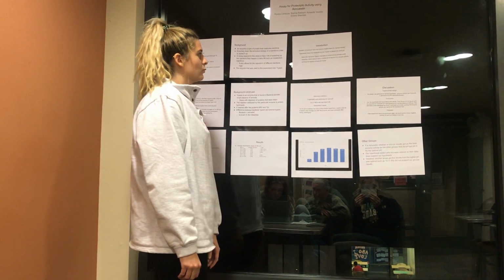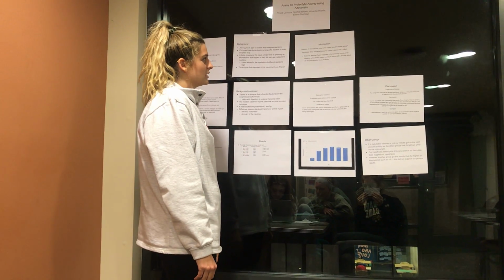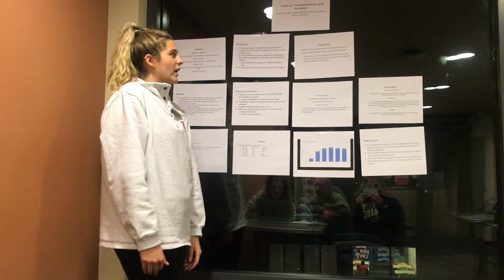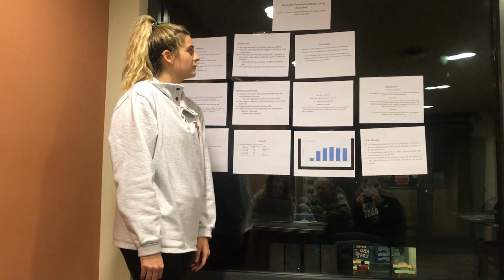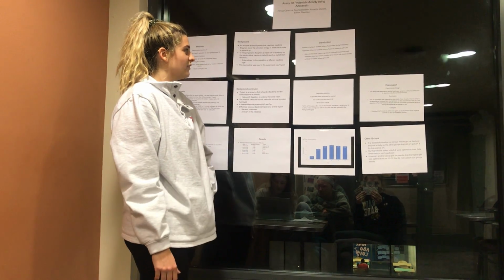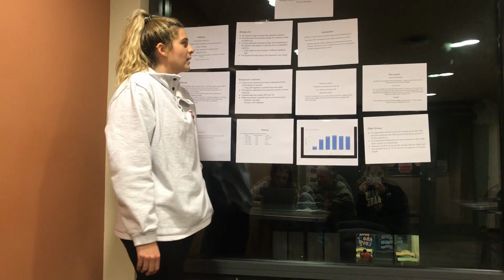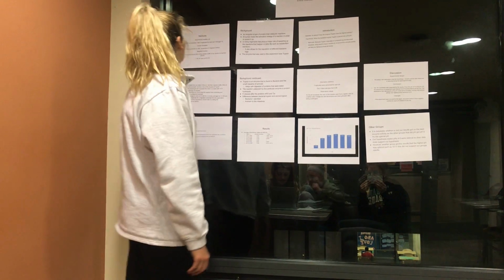Our hypothesis was that when the bacterial enzyme trypsin is placed into a pH of 8 to 9, that will be the highest enzyme activity. Our rationale was that trypsin originates in the small intestines of living animals, which tend to have a basic pH of around 8 to 9. Enzyme activity will likely be highest at these pH levels.